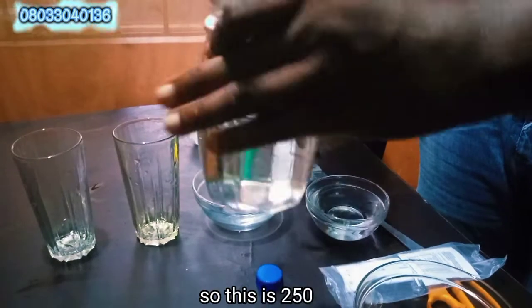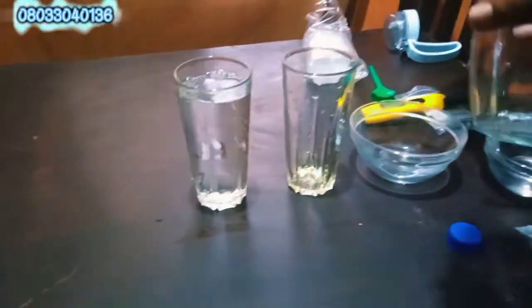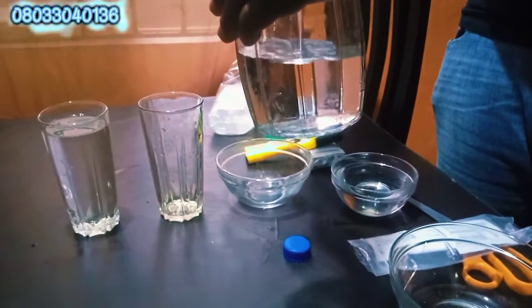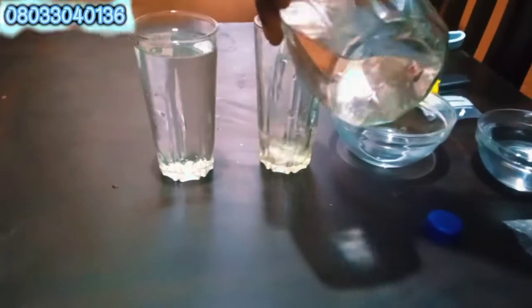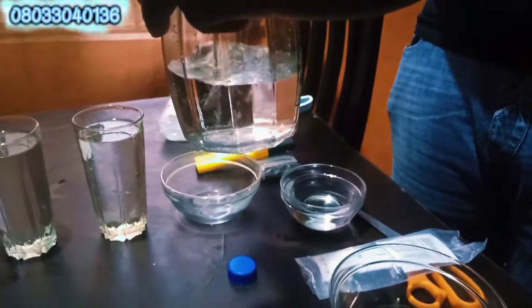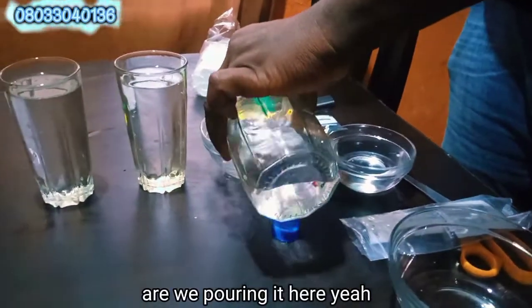So this is 250. I'll be pouring it here. And again 250, I'll be pouring it here. And again 250, I'll be pouring it here.